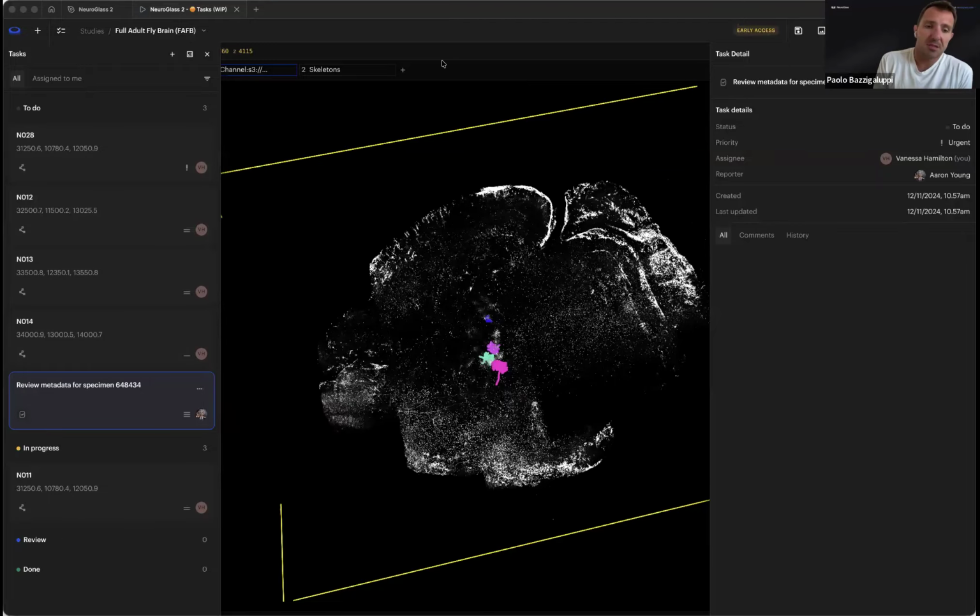After Matteo gave us an overview of what NeuroGlass can do today, and Saya took us through what NeuroGlass is going to be able to do in the very near future, I just want to take the last few minutes of this webinar to give you an overview of what is going to happen in the next 6 months, so by the end of the year.